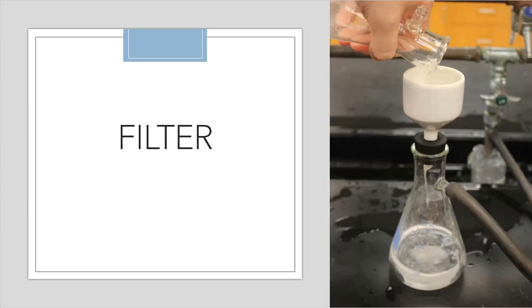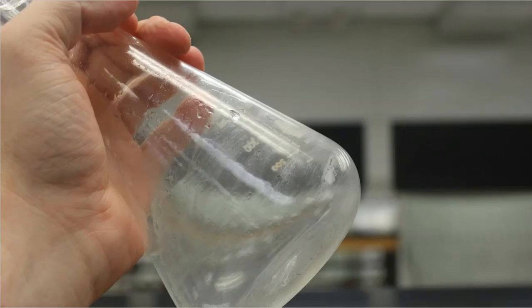When I did that, as you can notice, this filtrate now is cleared up. No longer is there a solid sitting down below. Okay, so that's very good news for me. That means maybe at this time it did fully fall out, and I was just a little too fast on it the first time, and I caught it before I dumped it. So that saved me some of the percent yield. In that filter flask, this is what was left over. So again, you can make your observations there. Did I transfer everything? I don't know. You tell me, all right?